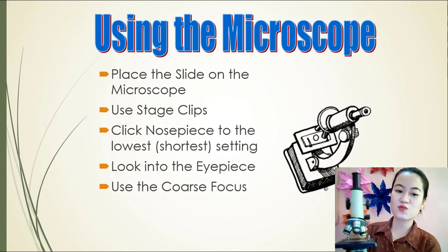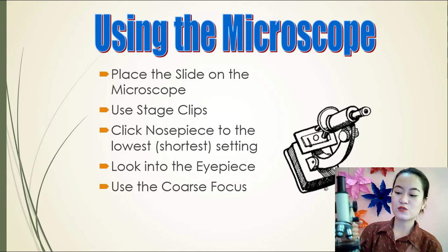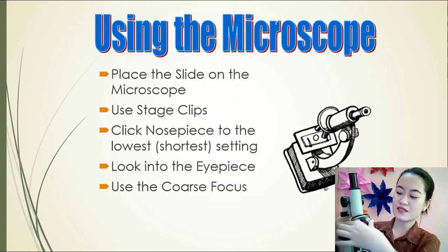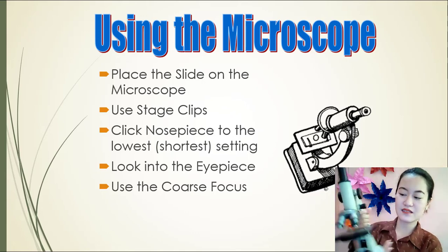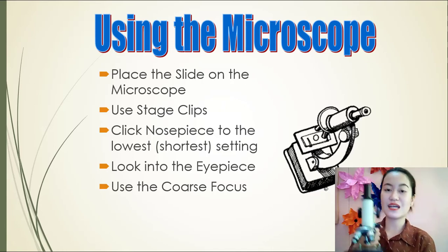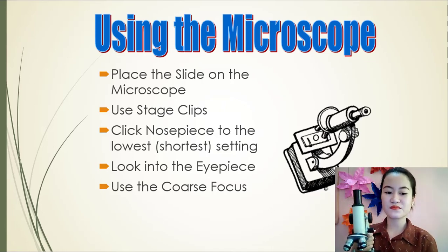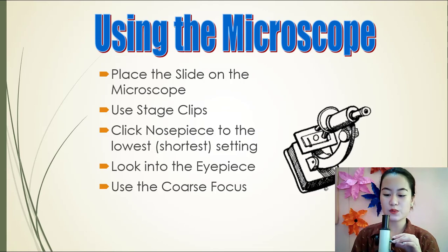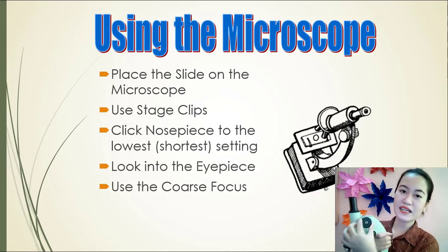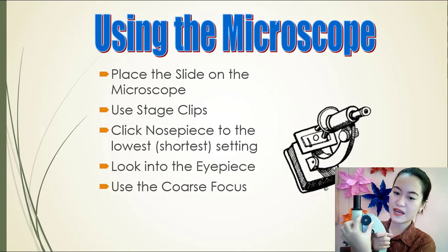Click the nose piece to the lowest. Okay, to the lowest daw. Click natin siya. Pinakang lowest natin is 4 times. Okay, naka-set up na. Next, look into the eyepiece. Okay, doon natin titingnan. And then, use the coarse focus. Yan, tingnan natin. Yan. So, gagamitin lang natin tong focus na to para ma-focus natin dun sa specimen.